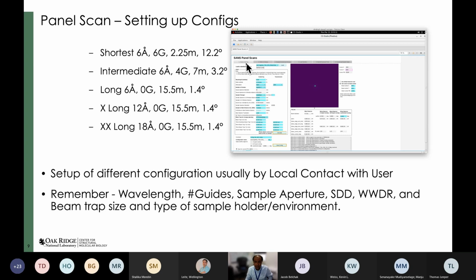It has 6 tabs. The first tab is really to create the configurations. We can create customized configurations, but as I mentioned, a lot of the calibration then has to be done during your beam time. If we can avoid doing that, that'll be much more useful for you. What we normally calibrate during a calibration time is these, which I've already touched upon: first very close to the sample, intermediate, farthest from the sample, and then we turn the wavelength knobs.